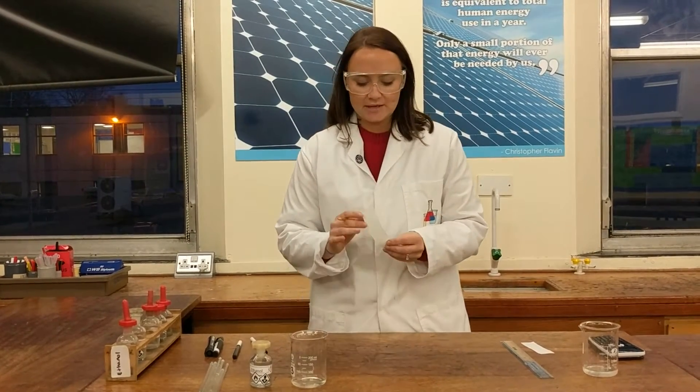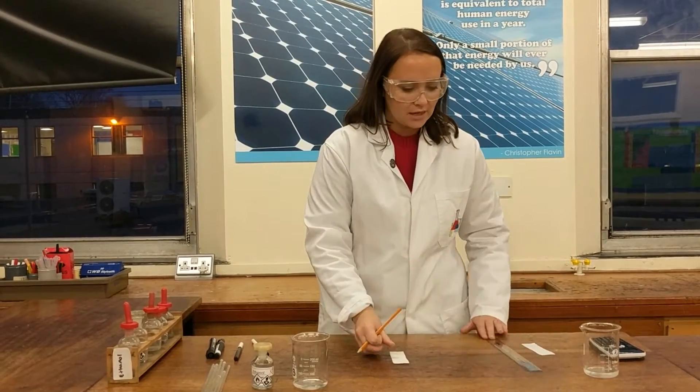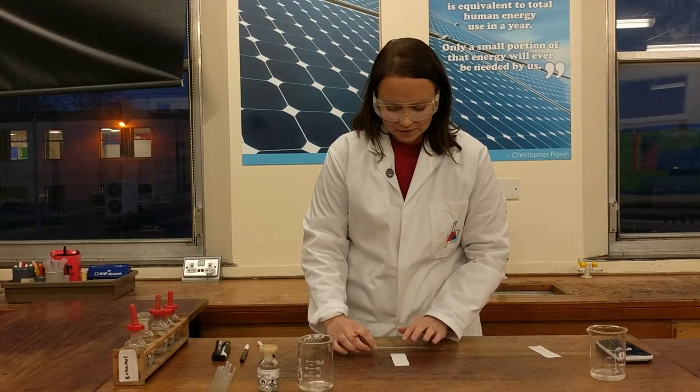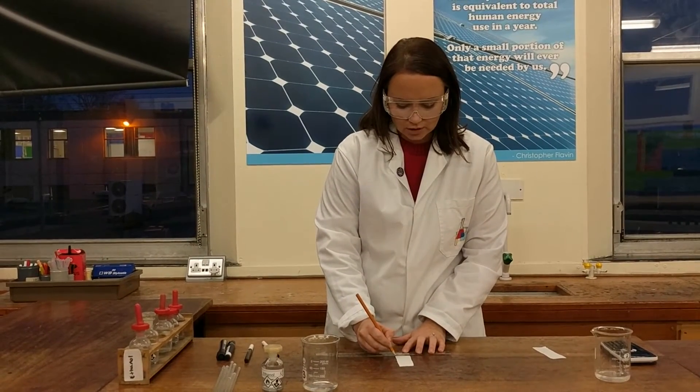So for chromatography you need a piece of chromatography paper, which is more absorbent than normal paper. Get a ruler to set it up, and about one centimetre from the bottom you will draw a pencil line.